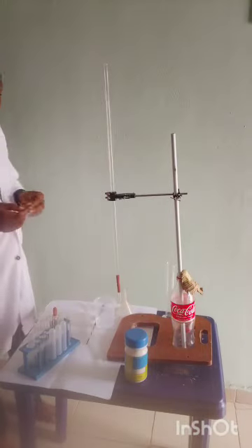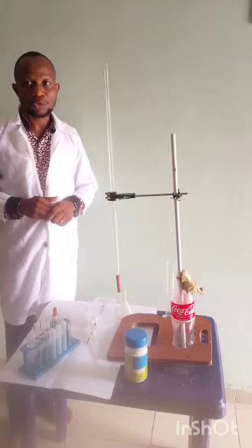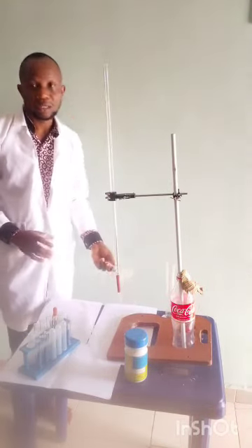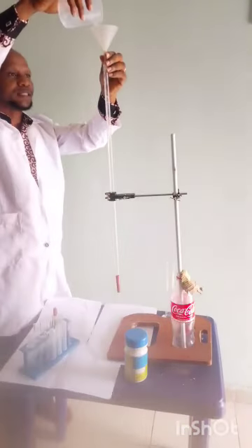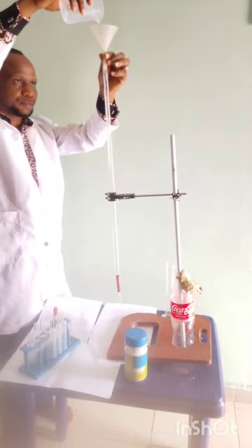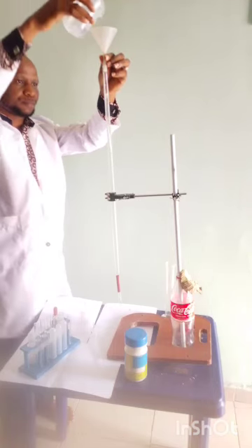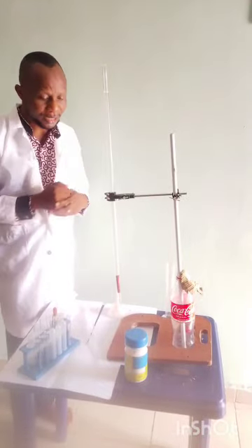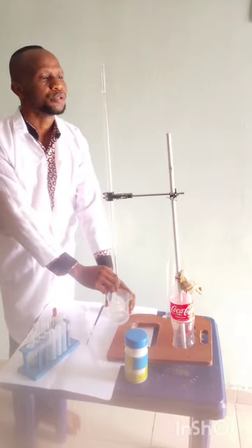Now, moving forward, having explained that, I will just quickly show us how you run through your steps for titration practicals. You load the acid a little bit above the 0 mark. Then you ensure to zero.